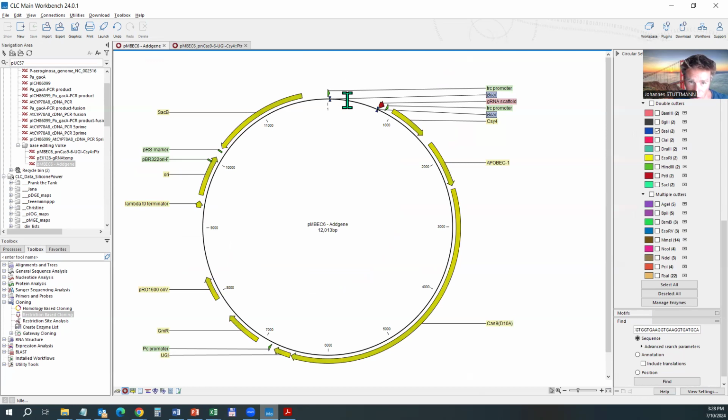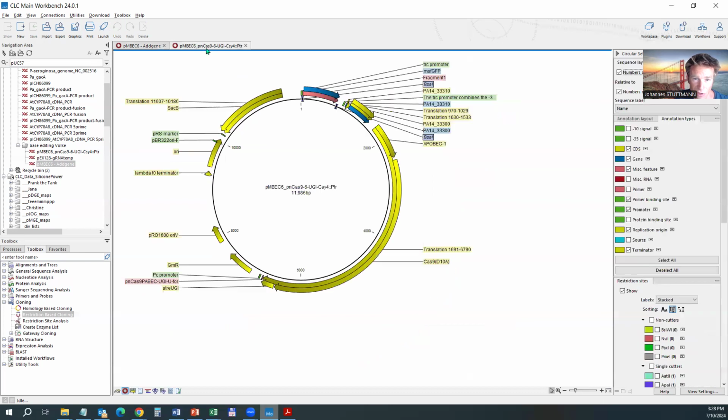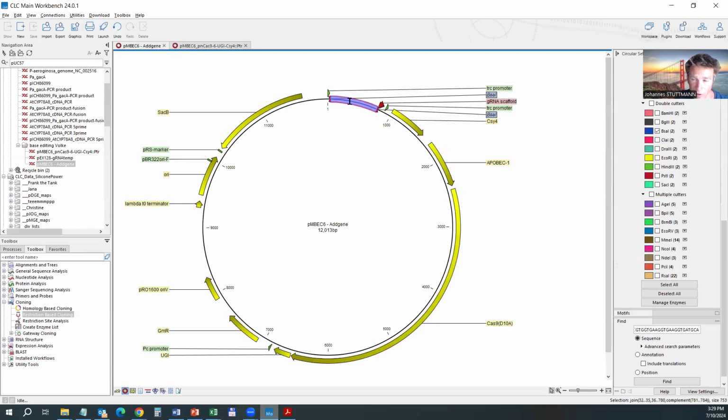And then we have here a multi-cloning site. So there are two BsaI sites which are flanking a GFP gene. The GFP gene is not annotated in this version. You can see it here, msfGFP. But I also confirmed that it is there. So the empty plasmid, when transformed into E. coli, will give GFP positive clones, while once we replace this cassette for our insert, so actually a guide RNA, then the clones will be non-GFP, GFP negative.